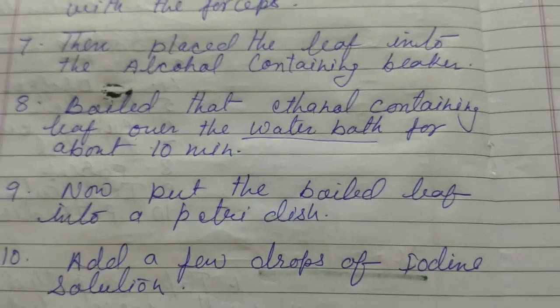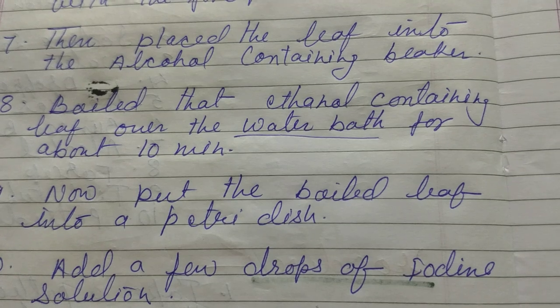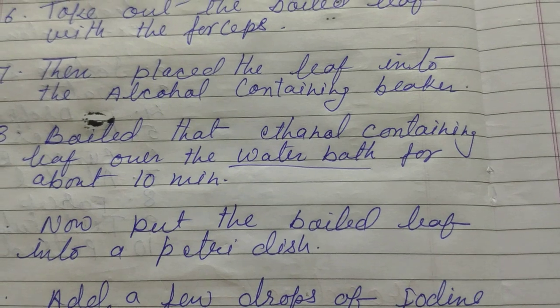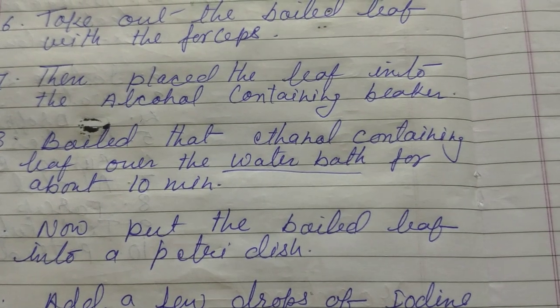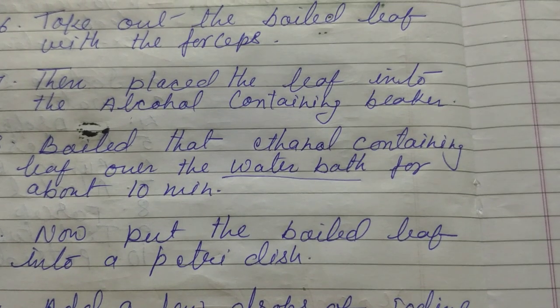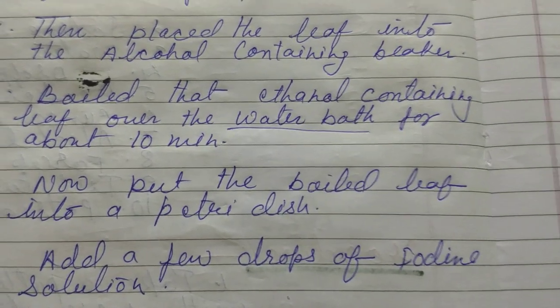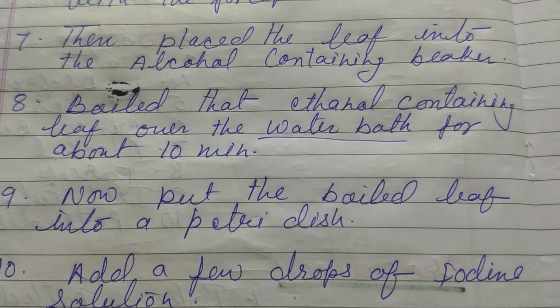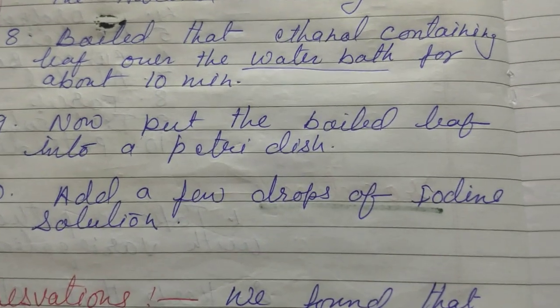Now what will happen? After 10 minutes, put the boiled leaf into a Petri dish. After boiling for 10 minutes, we have to take out the leaf again with the forceps, take a Petri dish, and keep that boiled leaf into the Petri dish.